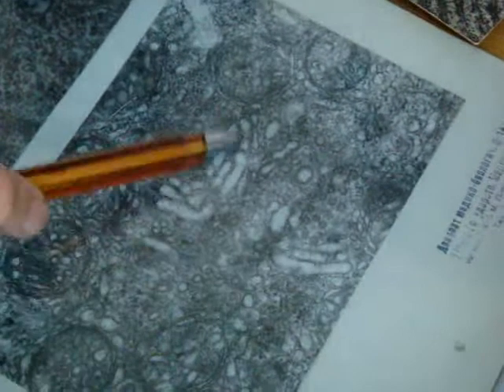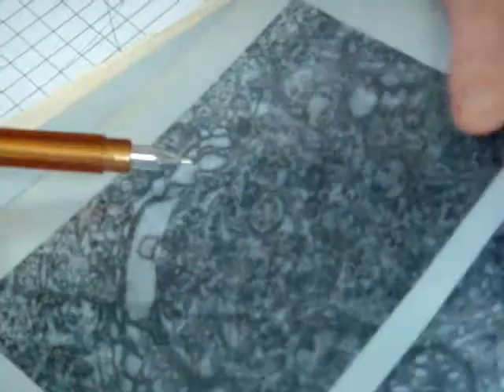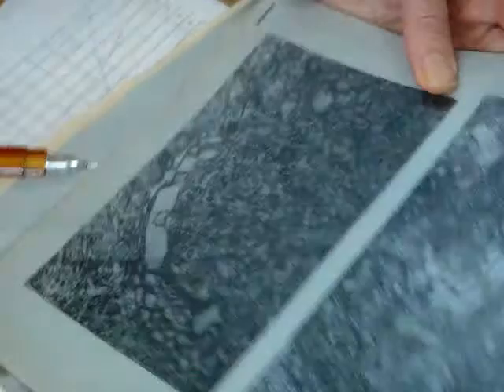Again, we can see mitochondria with a tubular-vesicular type of cristae. This may be Golgi apparatus, or smooth endoplasmic reticulum, it's unclear, but we know that such mitochondria we can see in cells that produce steroid hormones. What is it? I think these electron micrographs demonstrate the Golgi apparatus for you. The Golgi apparatus is destroyed, but mitochondria and other structures are understandable.